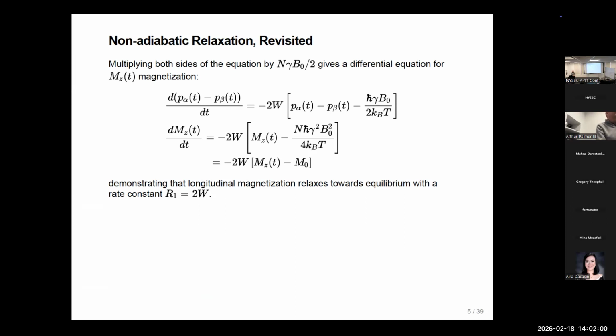So prior to the invention of these polarization transfer tricks, what you said would be true. But now, with INEPT, we can transfer polarization. And then, of course, with DNP, you can transfer polarization from the electrons and have hundreds of times more polarization on the spin than its Boltzmann equilibrium.